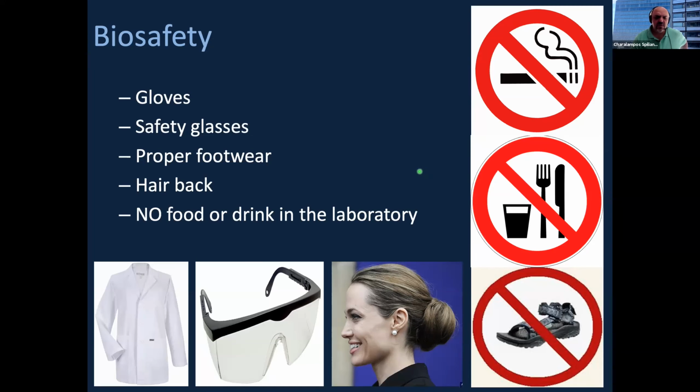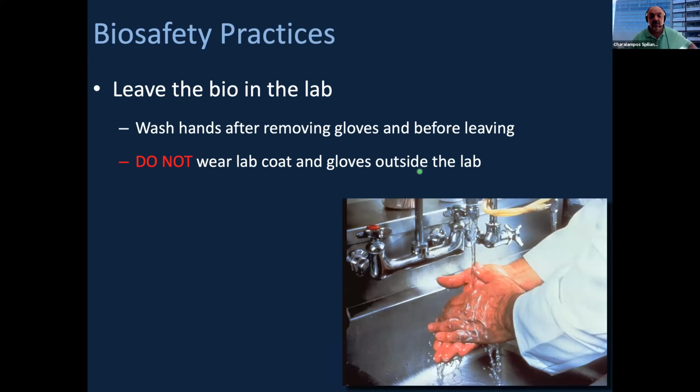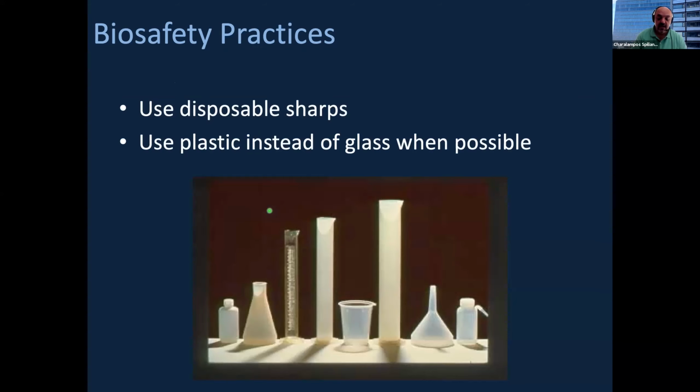Otherwise, I had this accident in the past, mostly with chemicals. Not my feet, but clothes. I destroyed a lot of clothes when I was not wearing a lab coat. As I said, washing hands during the day has actually been the best way of not being contaminated. And as I mentioned before, do not wear the gloves and the coat outside the laboratory where you perform your experiment.